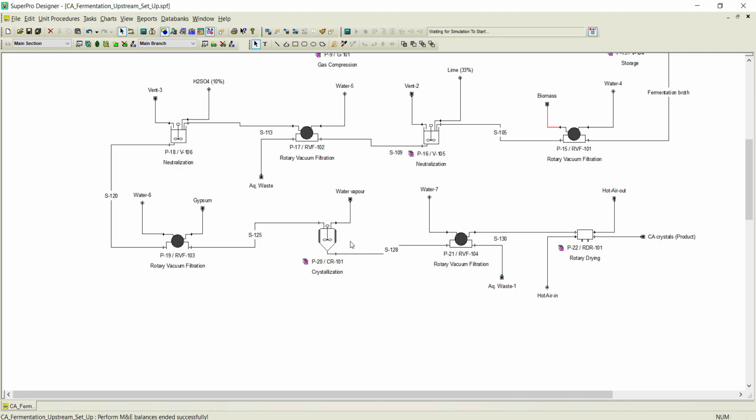I hope you understand how to simulate a somewhat complex process in the software, like a complex process in bioprocess or chemical process industries. If you properly understand this particular simulation, I think you can set up any kind of process and simulate it. Basically, you may need to use it for your academic project purposes, or you can use this simulation effectively for your research studies also.